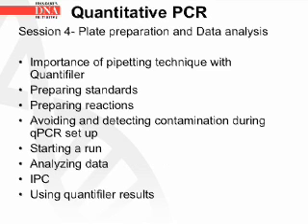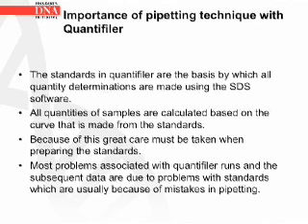In Session 4, we will be going over the following topics: importance of pipetting technique with Quantifiler, preparing standards, preparing reactions, avoiding and detecting contamination during qPCR setup, starting a run, analyzing data, the IPC, and using Quantifiler results. Let's talk about the importance of pipetting technique with Quantifiler.